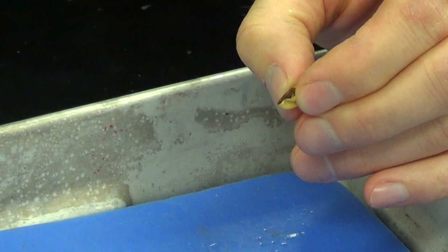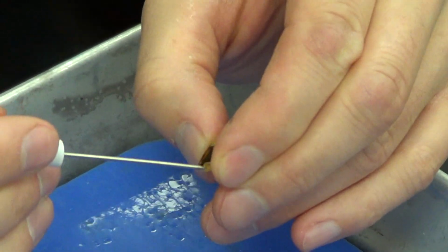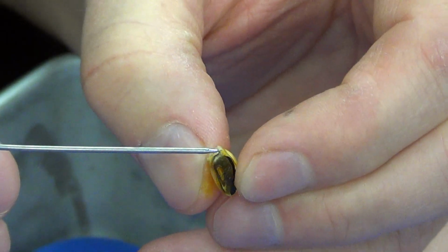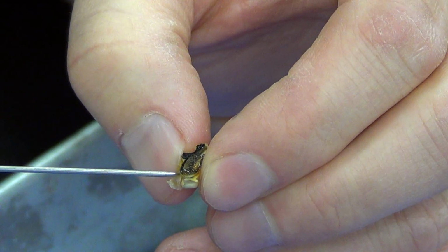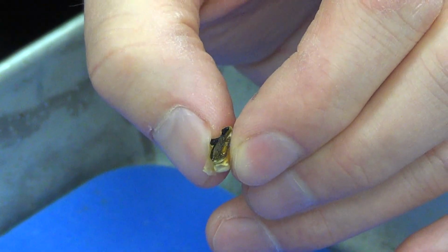Here we go. So let's go over the parts of this monocot seed. This is going to be a little difficult, but the outer part, you can see that there's an outer tough layer. I'm going to get the dissecting needle underneath it. I'm actually teasing back a little piece of it here. There it is right there. That's going to be the seed coat, and that is a protective covering, mainly to protect the seed against digestion when other animals eat it.